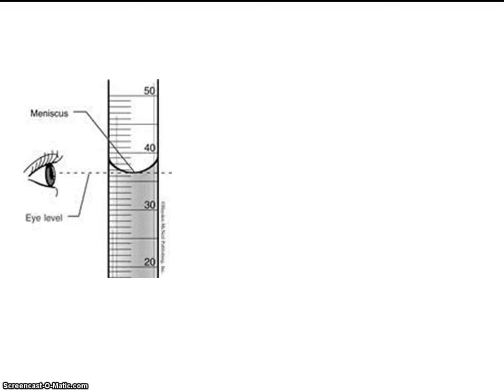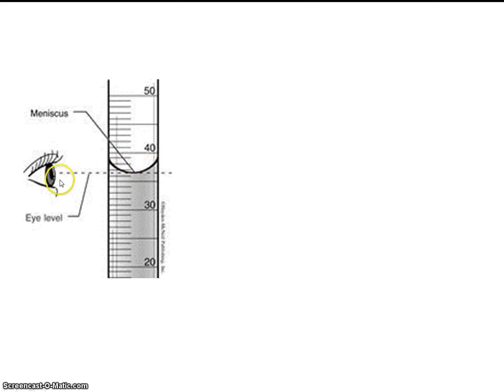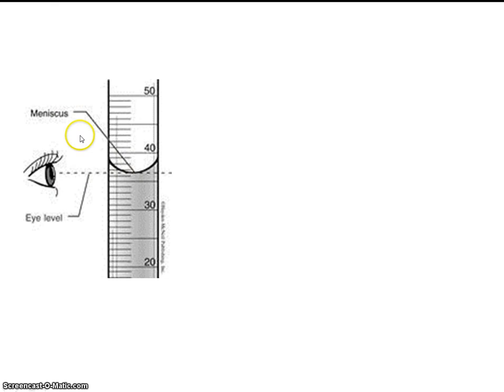This is reading from a graduated cylinder. Anytime you have water in a graduated cylinder or some type of narrow capillary tube like this, you'll see the water forming a meniscus. You always want to read from the bottom of the meniscus. Additionally, you want to get your eye down at the same level as the meniscus, so you're not reading at an oblique angle or anything like that.